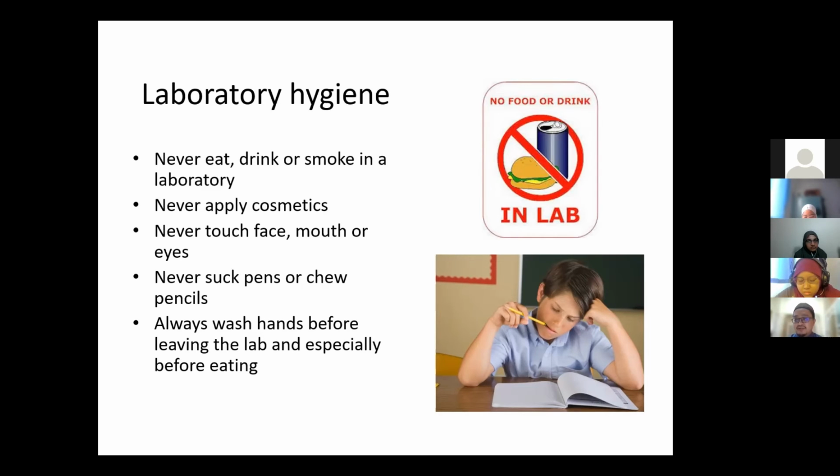Yes, our lab at the degree undergraduate level ni, you tak ada pakai apa-apa yang very infectious, but we would like you to get this as your habit from now, yeah, so that dia tak jadi habit when you are working.